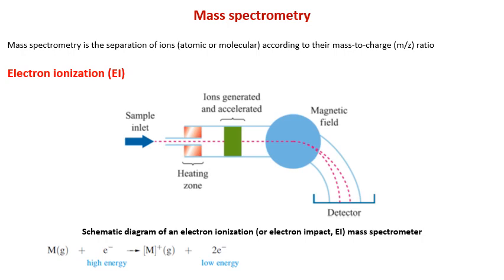Now the molecular ion, which is normally written as capital M in square brackets with a positive charge, is a radical cation, and is strictly written as capital M within brackets plus, as shown over here. You can see the scheme is given over here. The sample is shown as M in the gaseous state.